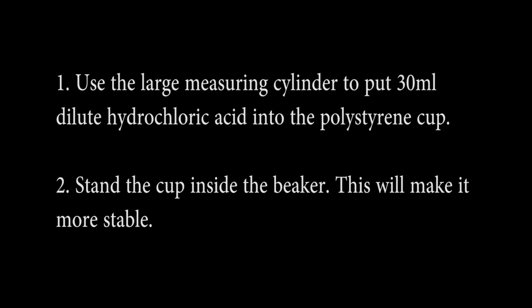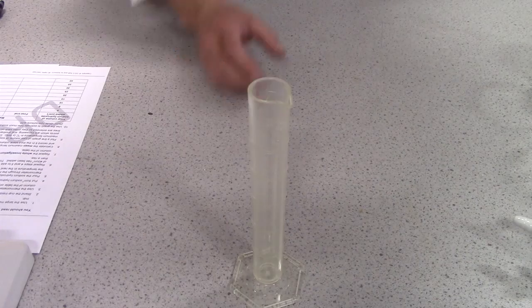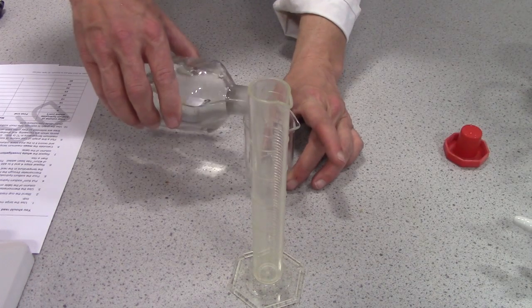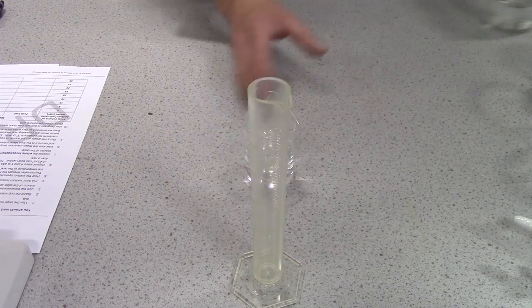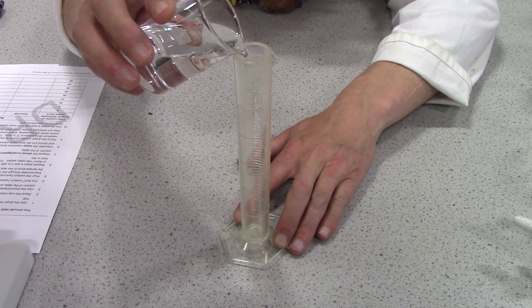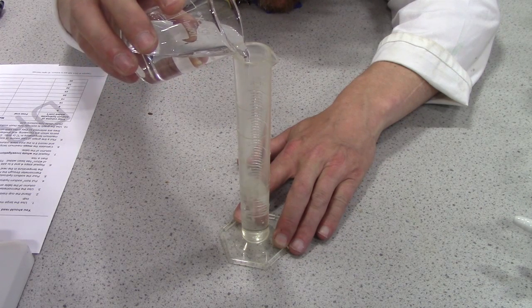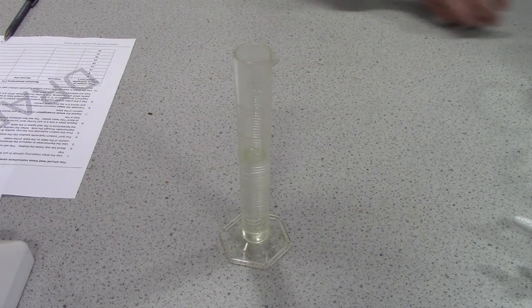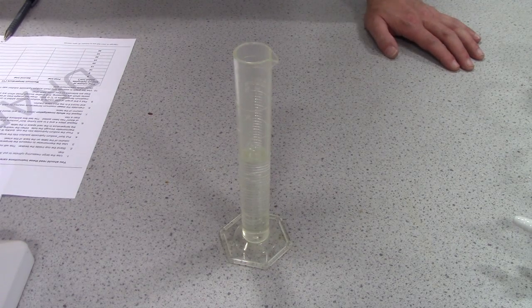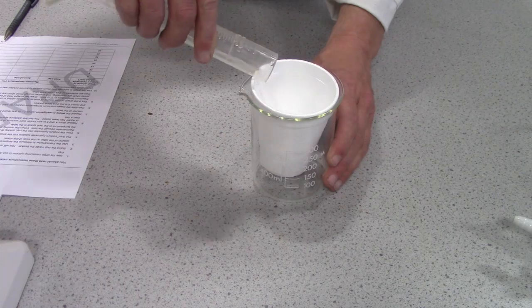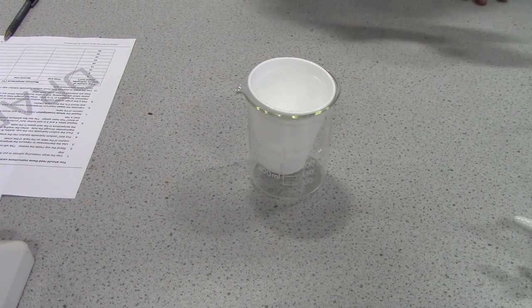Step one: use the large measuring cylinder to put 30 centimetres cubed of dilute hydrochloric acid into the polystyrene cup. So that's 30 ml of dilute acid. Crouch down until the graduations line up either side. Pour that into the polystyrene cup and stand the cup inside the beaker. Put that back next to my acid.